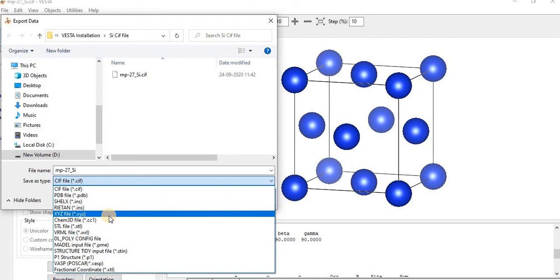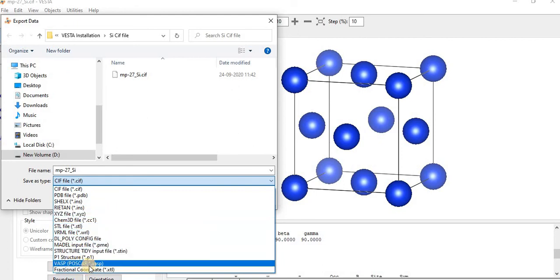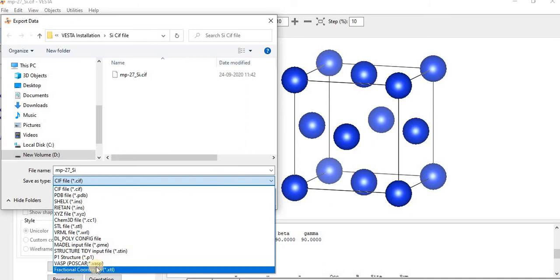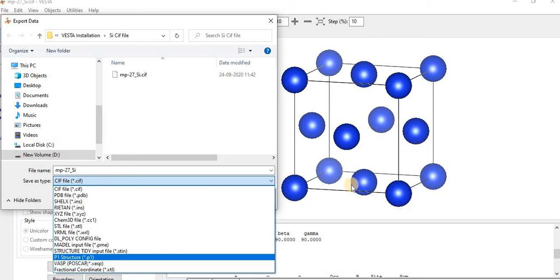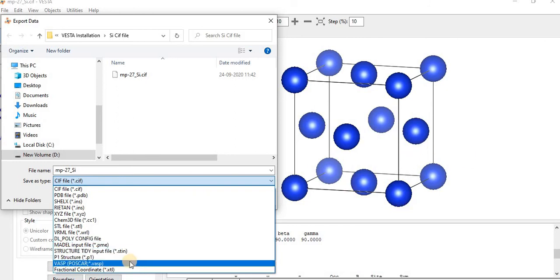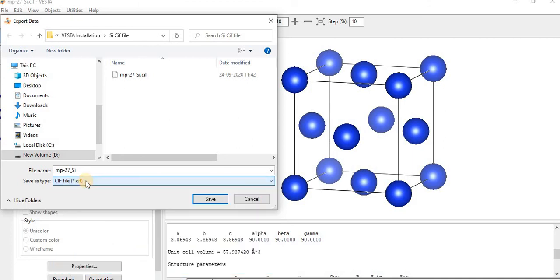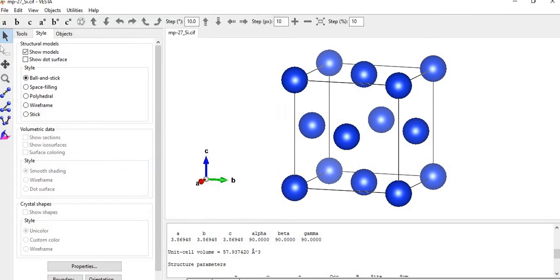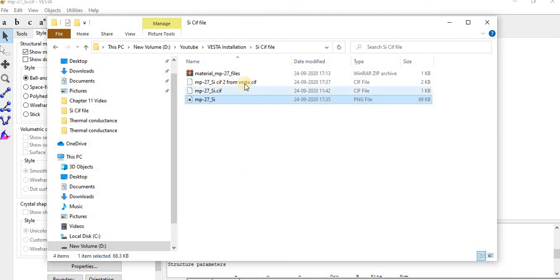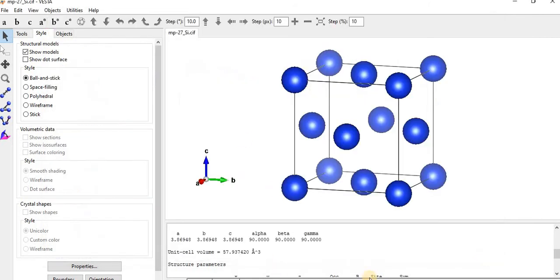There's XYZ file which is used for refinement applications, then VASP. This is a very good software for calculating electronic structure and other electronic properties. For POSCAR file we can get from this image also for VASP, a simulation package. Let's see, this is the CIF, then I click the name CIF from VESTA, then click and save.